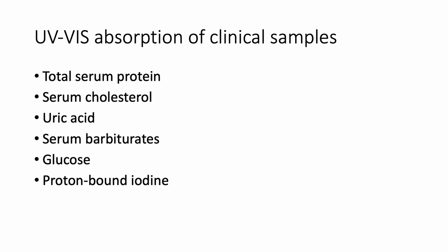I don't know if this has ever happened to you, but you get pulled over and they make you breathe into a breathalyzer, right? You have to breathe into this breathalyzer. So you breathe into the breathalyzer, right, and it's going to measure the ethanol in your breath. And this is a spectroscopic technique. What it does is that you breathe into the machine.